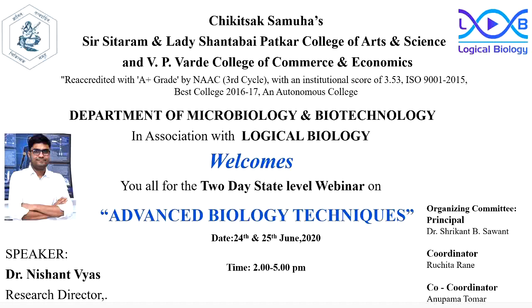So in these 2 days lecture series, we are going to discuss flow cytometry, secondly the world of animal cell culture, or specifically human cell culture, and quantitative real-time PCR based gene expression analysis.